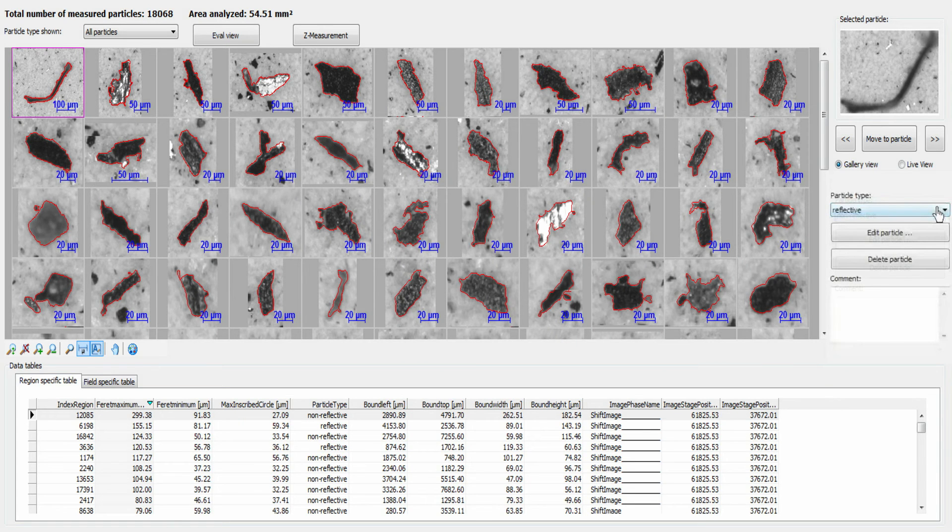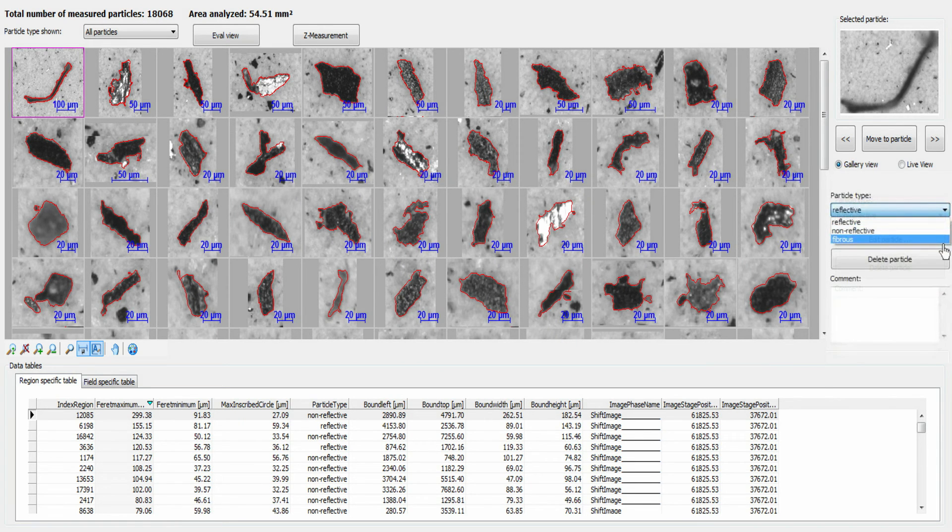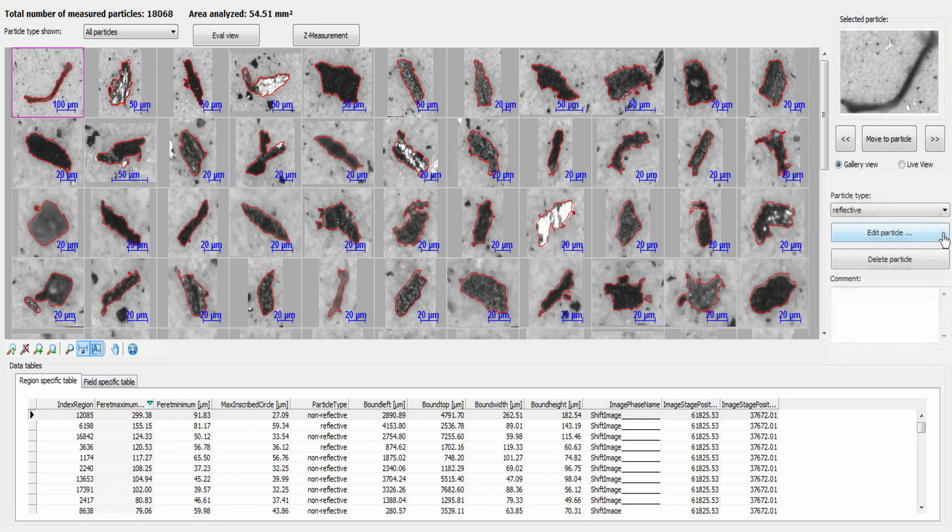Use the easy to operate revision mode whenever you want to reclassify or edit particles.